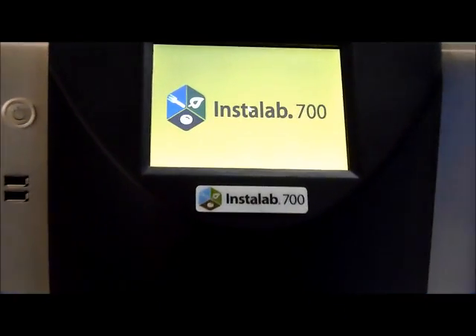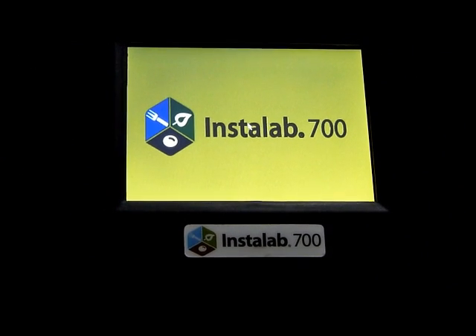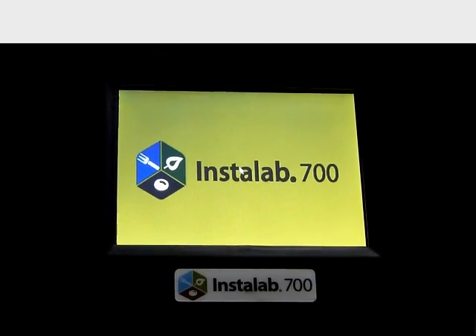Dickie John's Instant Analyzer Instalab 700 is used for analysis of moisture, protein, oil, and fiber in oilseeds, oil cake, and de-oiled cakes.